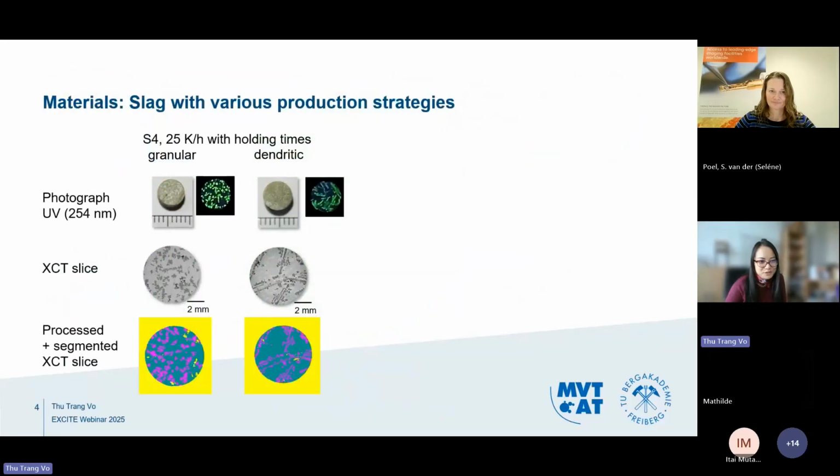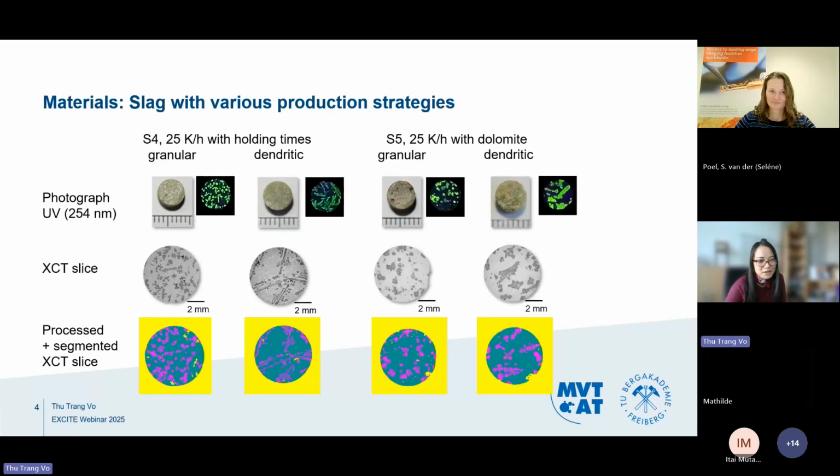So just for you guys to see how my material usually looks like. I have different kinds of microstructures, and these microstructures need different kinds of treatment when it comes to sample preparation, when it comes to image processing. It will get more and more complex when we also have cracks that appear. So our first tip when it comes to sample preparation is make your sample as easy as possible so that in the end your image processing is not that hard.